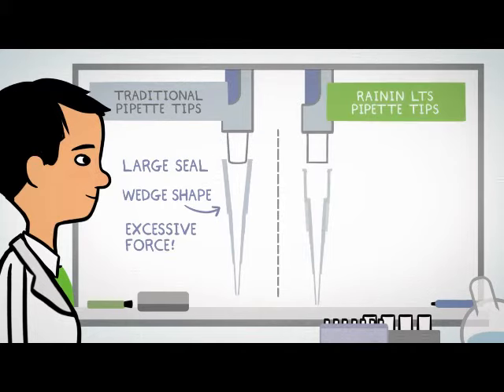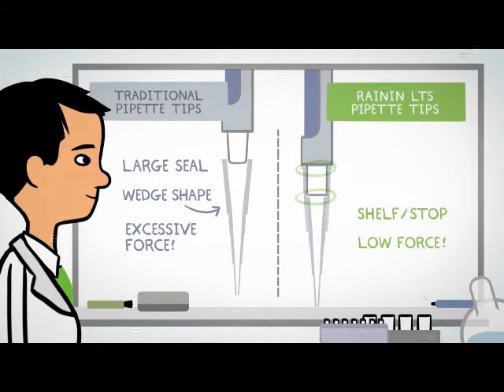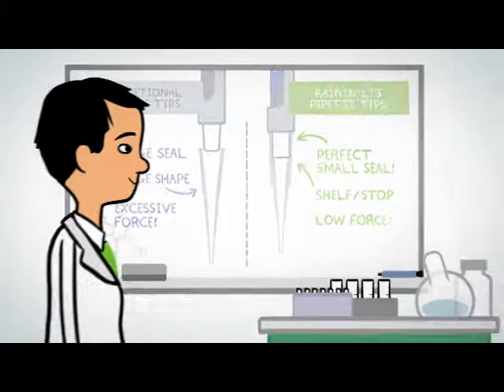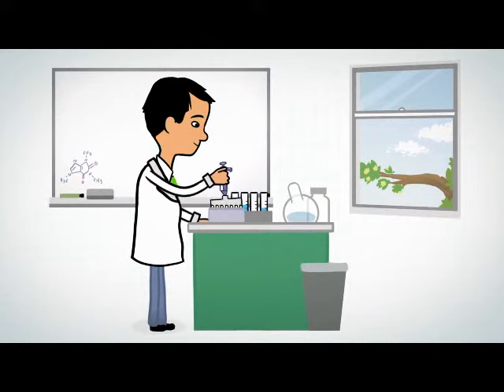But Rainin LTS pipettes and tips are different. The sealing ring and stop work together to prevent you from using excessive force and make a perfect seal every time. They're as easy to eject as they are to put on.